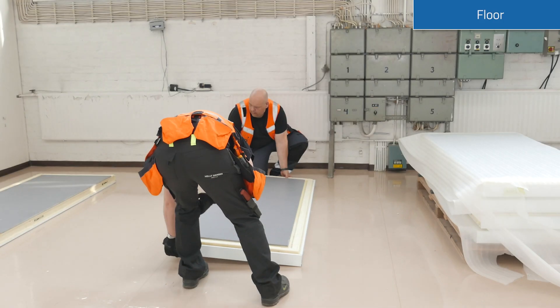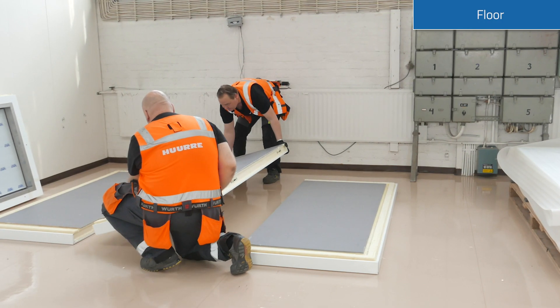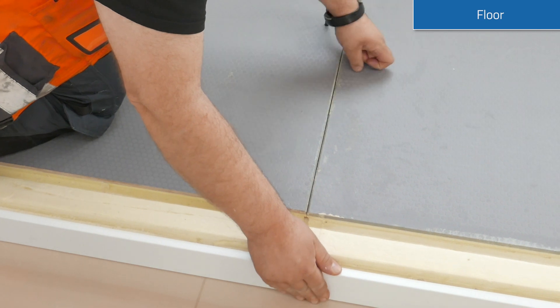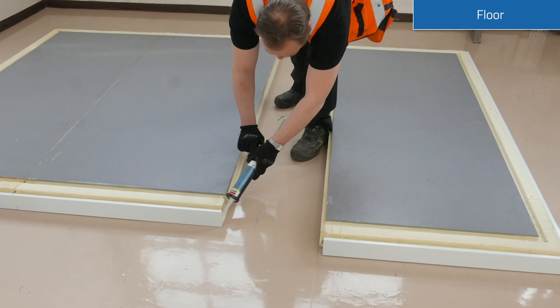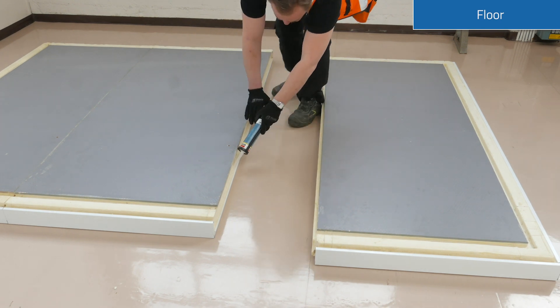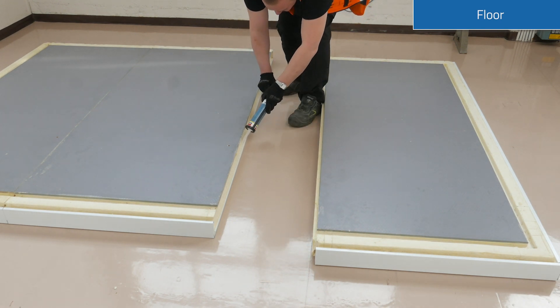Ensure that the floor area to be used is clean and level. The freezer model's installation floor should always be treated against moisture and ice. Please remember to always use the silicone for sealing when connecting the panels to each other.